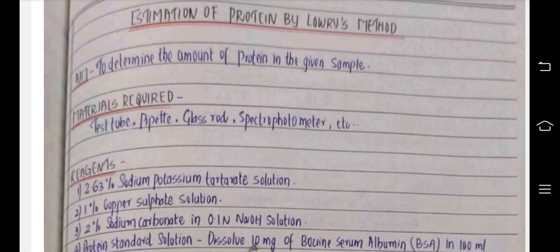Next experiment, estimation of protein by Lowry's method. Lowry's method is a very important method used for protein estimation. Protein estimation in the sense of quantitative estimation, to determine the amount of protein, so the quantitative amount of protein in the given sample. Materials used: test tube, pipette, glass rod, colorimeter or spectrophotometer.